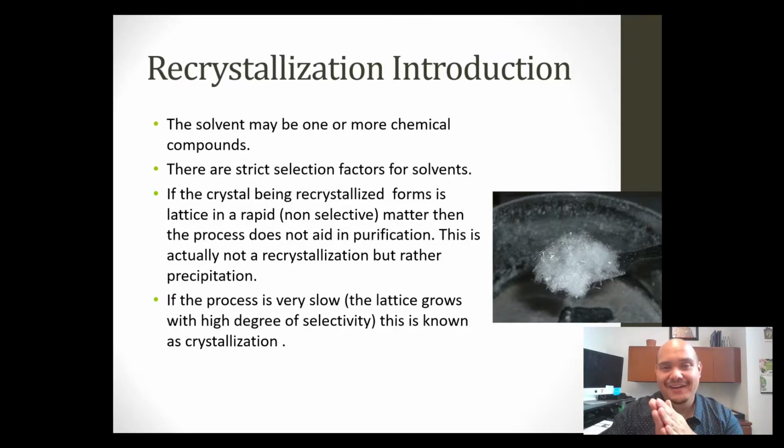Okay, so by now you should have done that small little assignment. And if you thought that by mixing ethanol and hexane, that would be a good representation of a solvent that has both polar and nonpolar properties, then you would be correct. However, we remember that polar and nonpolar compounds, when they are mixed together in liquid form, are immiscible. So these two solutions would not mix together.